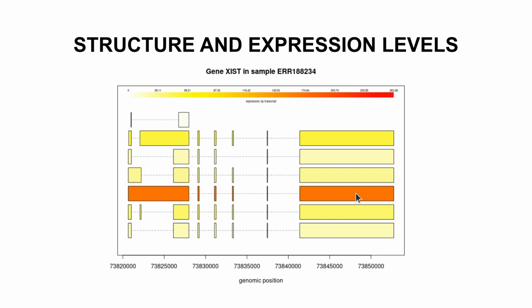So that is one cool thing about the pipeline we are using. It allows you to study in detail a gene as well as the expression levels for its isoforms in a particular sample. And so that is how it goes.